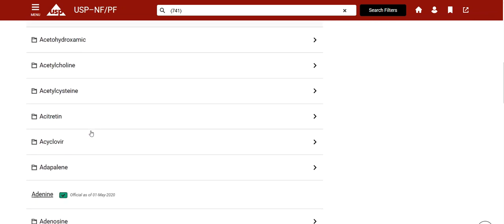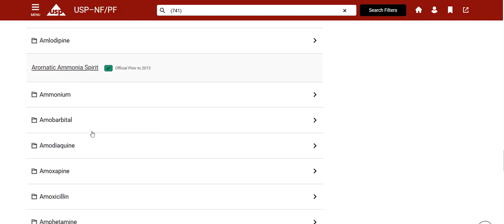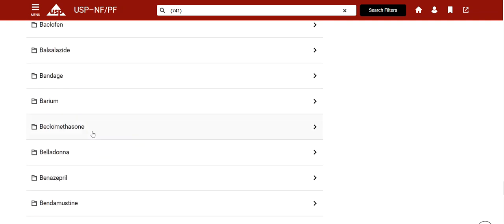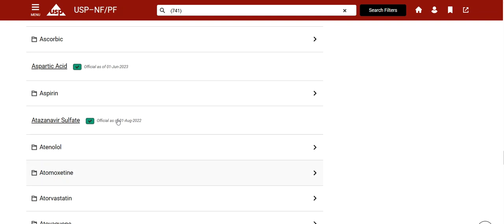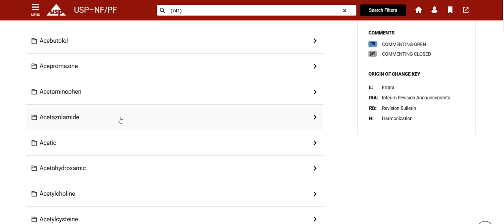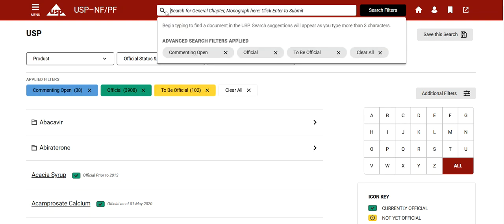All right, so within the USP, if I click that, then it's all going to be listed in alphabetical order. Look at this, it's just tons of stuff. I'm still scrolling, and I'm still in the A's, and we've got the entire alphabet to go through. So no one wants to do this. And let's say that someone submitted salt to the laboratory, and we've got to do the USP testing on salt, which is sodium chloride, by the way.